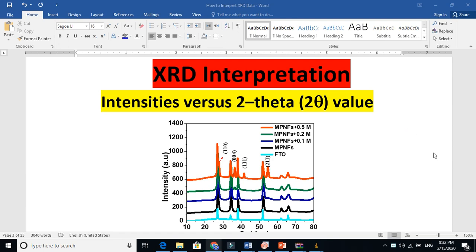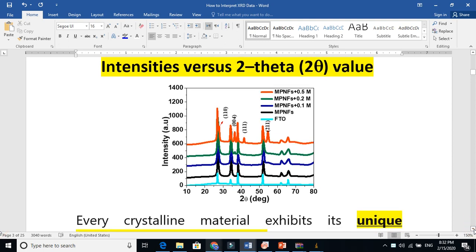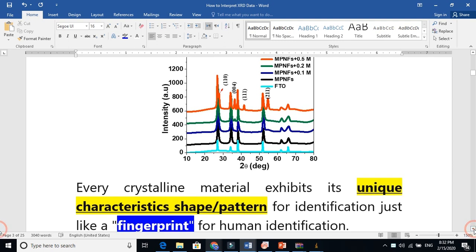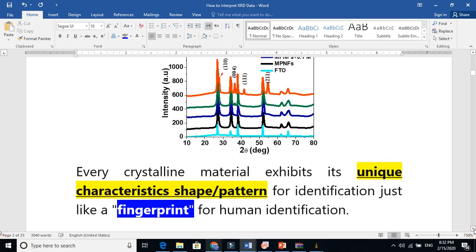XRD is the basic characterization of your material and this is the graph between intensity versus 2 theta. Every crystalline material exhibits its unique properties, unique shape and pattern for its identification.